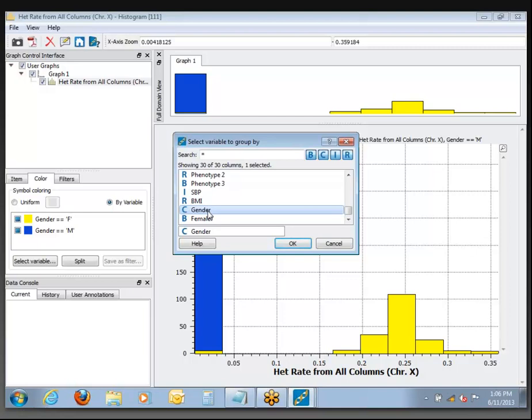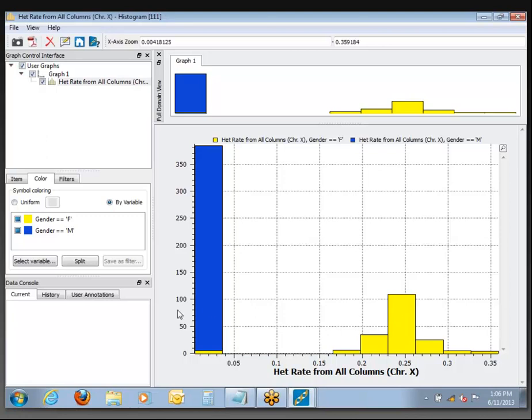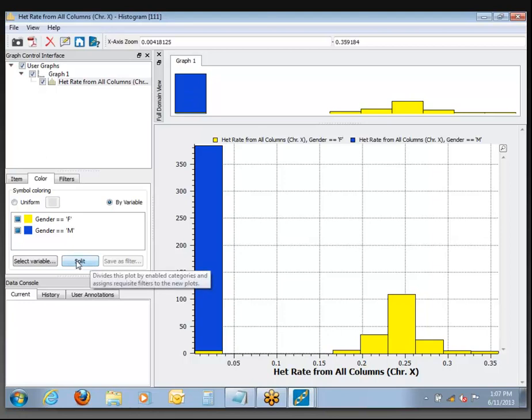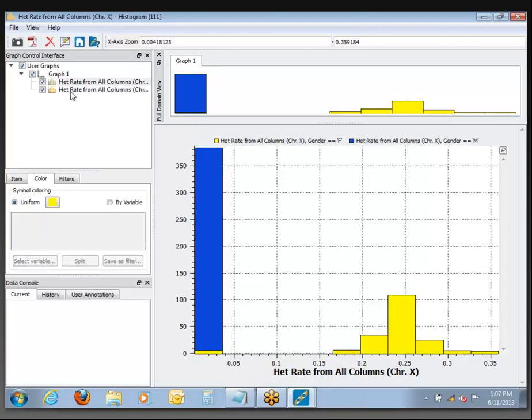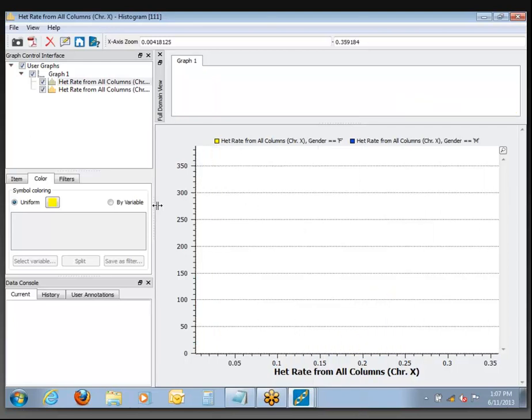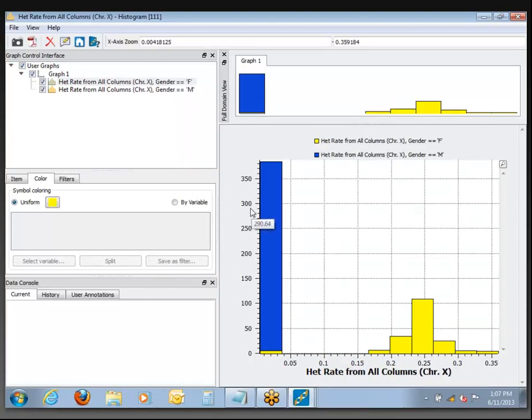The gender variable next to last in the list is the one from the phenotype spreadsheet. If you click that and then click OK, you can see that our histogram now has been split into two different colors. If you click the Split button, it comes up as two plot items — one for males, one for females — and that allows a little bit more control on how things are drawn.